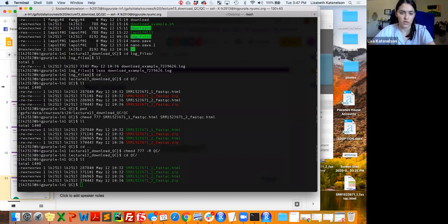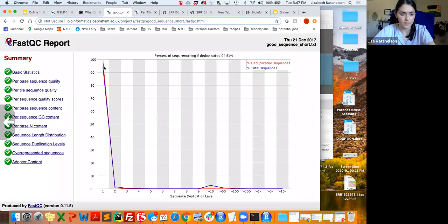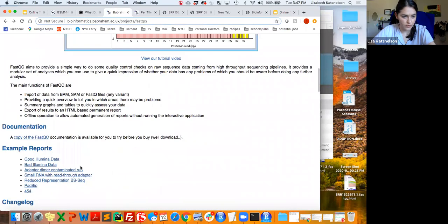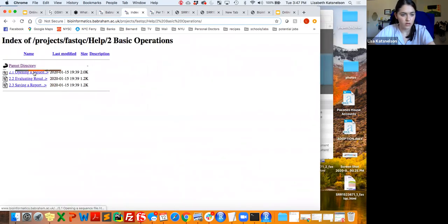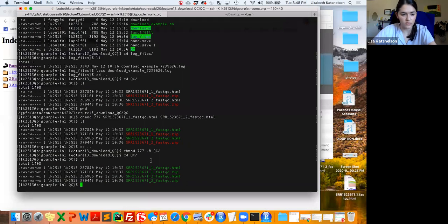I can go to the website for FastQC. Where is it? No, maybe I can just look here at the commands for it.